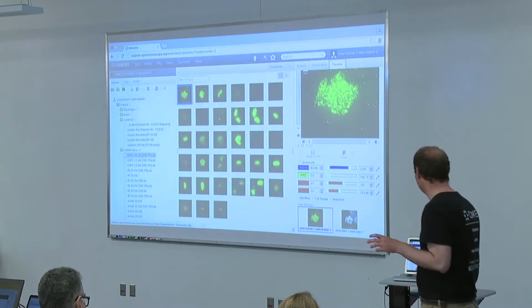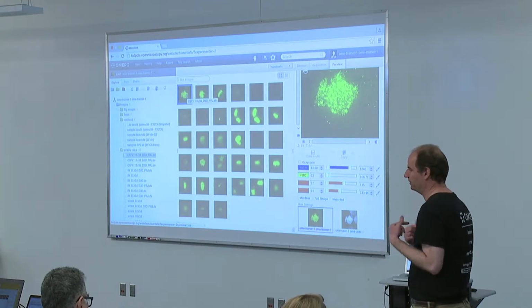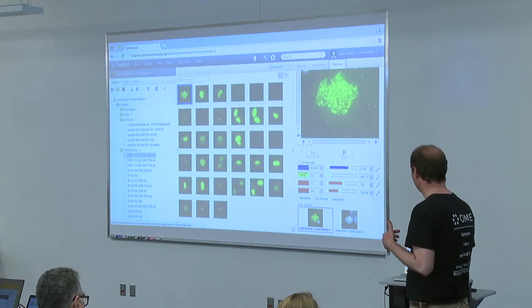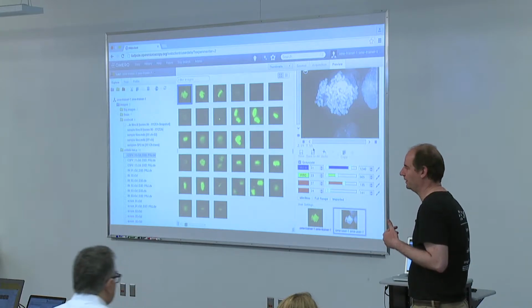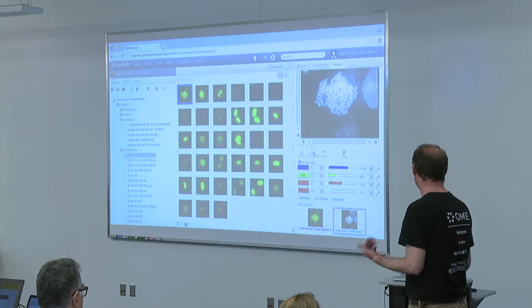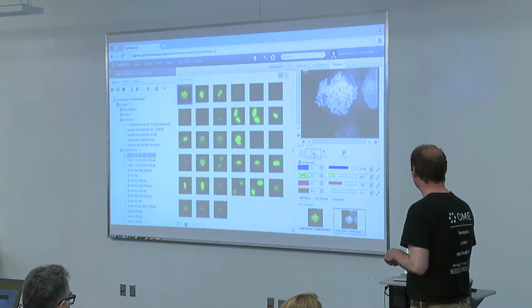So if he logs in as OME user 1 and goes and views this image, which belongs to OME trainer 1, he sees this image in black and white. I still see it in green. Okay. I can, of course, like his settings, I can take them like this, and then I say save to all, which will, of course, make this thumbnail gray. Well, why? Because when I say save to all, I like them so much that I'm making them mine. So I'm taking his pair of goggles and using them for my own forever. Okay, so let's do it.